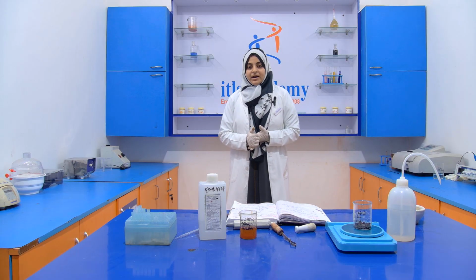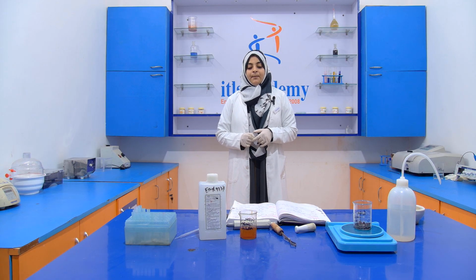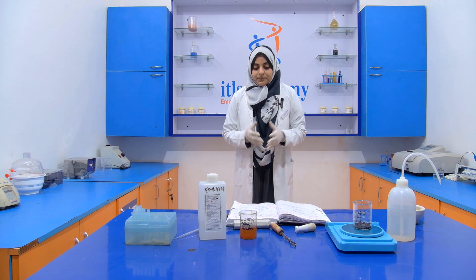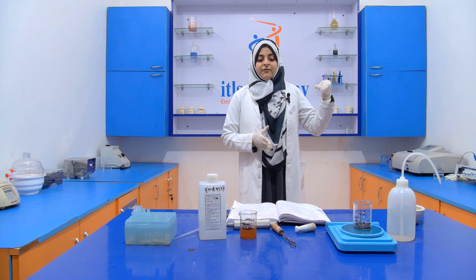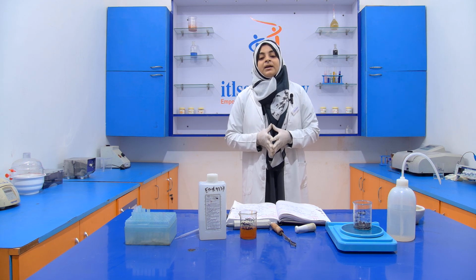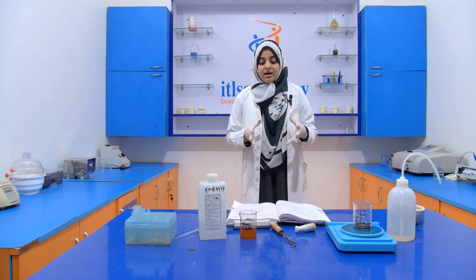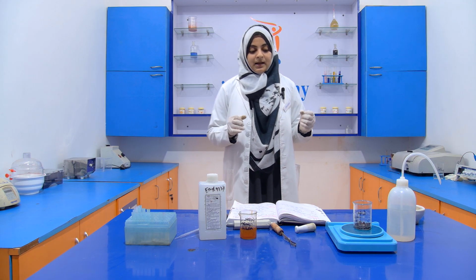If we have 5 gram of black pepper, then we have to add around 50 ml of this ethyl alcohol. In 5 gram we add 50 ml of ethyl alcohol. If we have 15 gram, then we have to add 150 ml of this ethyl alcohol.